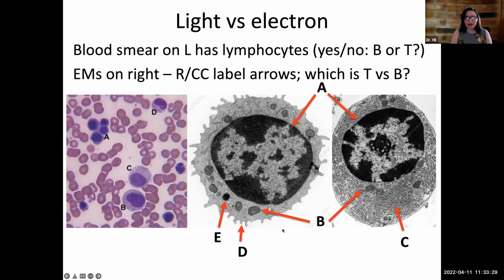Now I'm not going to cold call anyone for these, but if you see stuff in here besides what we've talked about, which is the endoplasmic reticulum, if you see anything in here and you think you know what that is, I'd love for you to raise your hand and tell us what you think it is. I'm just going to first lower the hands that I see because they might be left over. So now go ahead and raise your hand if there's one of these you want to take a stab at.